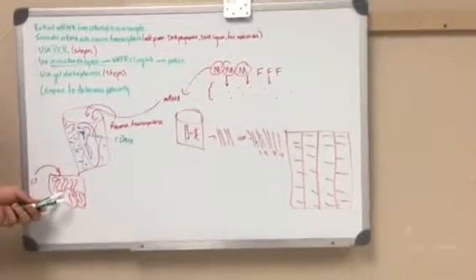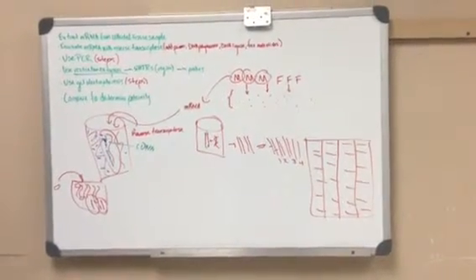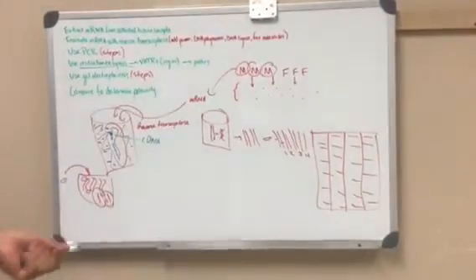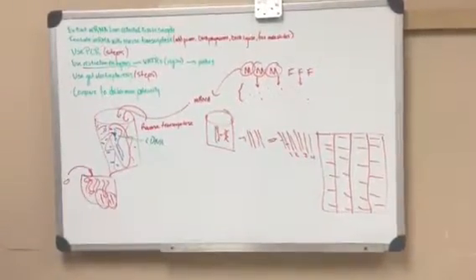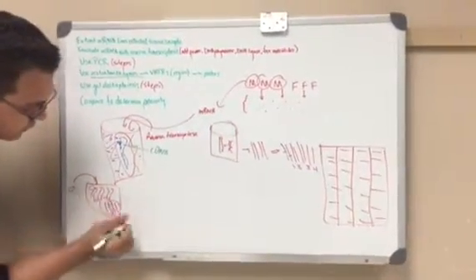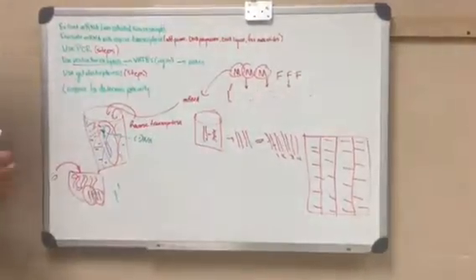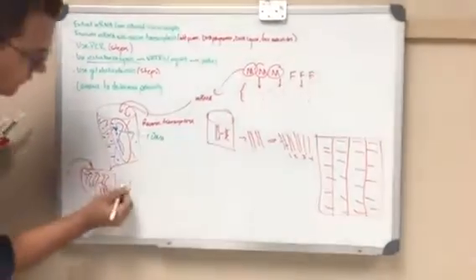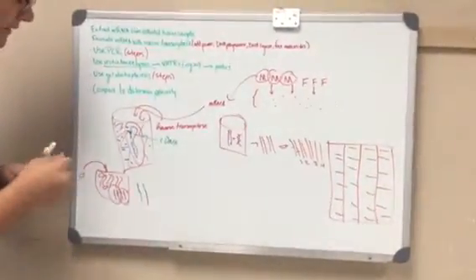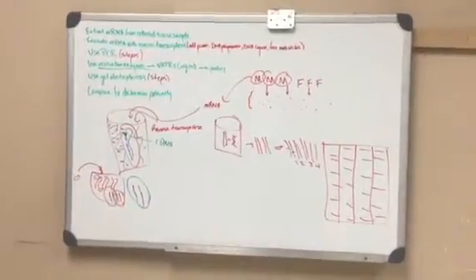So once we have the sticky regions, or the sticky ends, we're going to use probes, radioactively labeled probes, to attach to these sticky ends. So we're going to have these radioactively labeled probes. So now what we're going to have is basically DNA molecules that look like this. So now we know that this specific DNA molecule has the VNTR regions that we want.